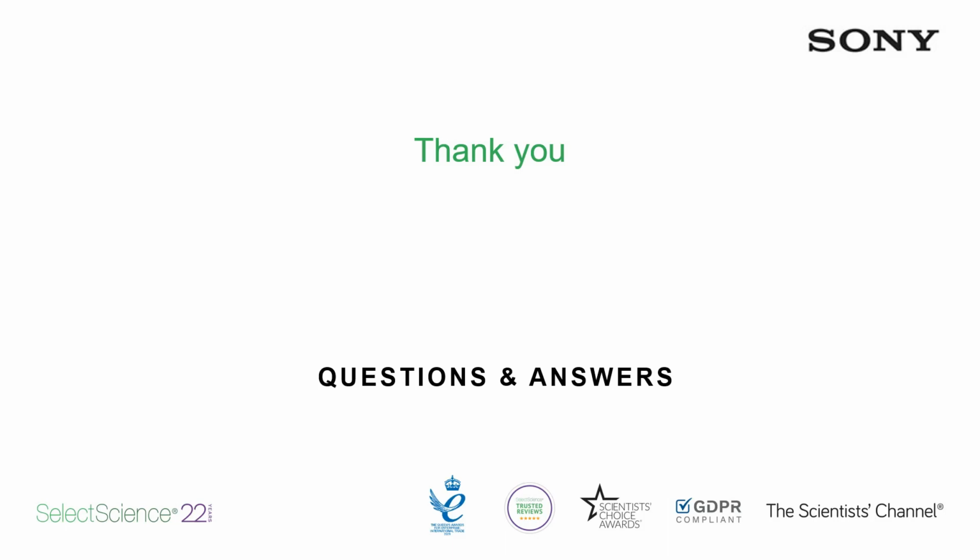Also a great question. Very easy. What we recommend people use is just 10% bleach and then DI water or MilliQ water, whatever the cleanest water you have available to you. And again, this can be done with a wizard, or you can just run them as samples on the instrument before you swap out the chip.